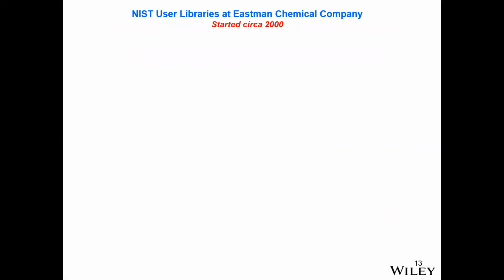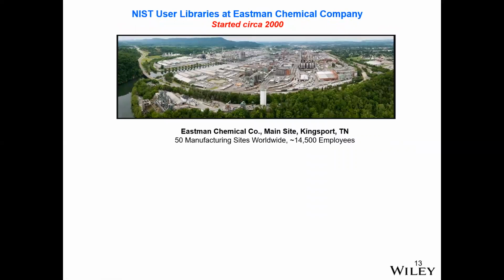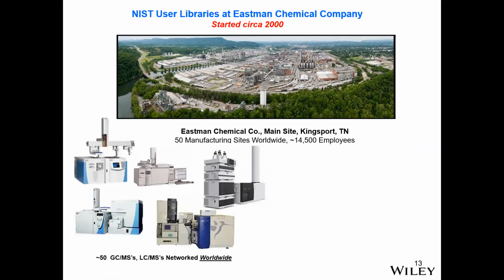So I want to talk about the use of user libraries at Eastman Chemical Company. We started with the NIST using it as our corporate search system in around 2000. And we used it pretty much at all our locations, our 50 manufacturing sites, anywhere we had a mass spectrometer. And we have about 50 GCMSs and LCMSs networked worldwide. So we have a large group of mass specs that we want to share information between the users so that we don't do duplicate work. And when something's identified in one place, it quickly is reflected at other locations.